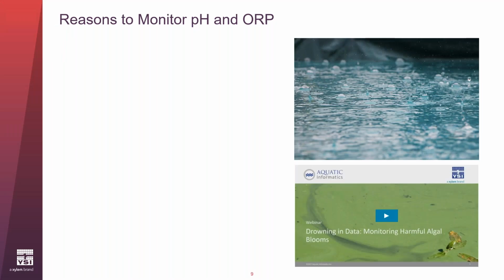So let's go ahead and get started. First of all, we have some reasons to monitor pH and ORP. Basically, there's some major contributors to pH and ORP change.